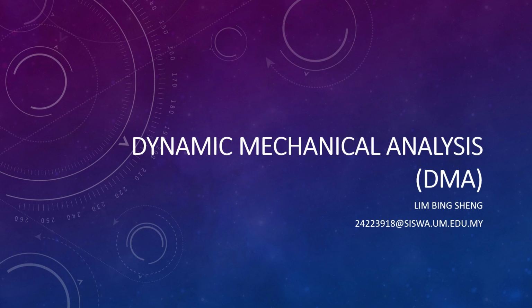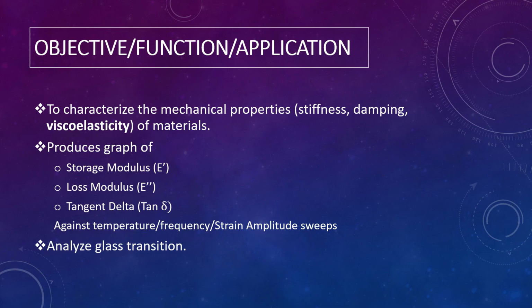I'm going to present DMA, which is Dynamic Mechanical Analysis. The objective is to characterize the mechanical properties, stiffness, damping, and viscoelasticity of materials, and then to produce graphs of storage modulus E prime, loss modulus E double prime, and tangent delta against temperature, frequency, or strain amplitude sweeps. In temperature sweeps, it is important for analyzing the glass transition.